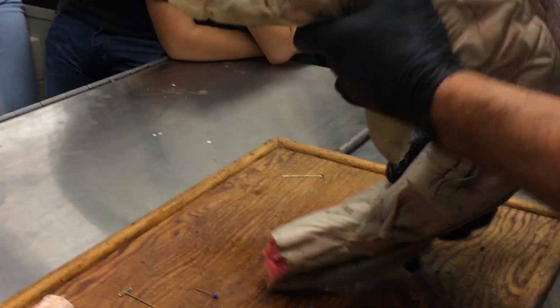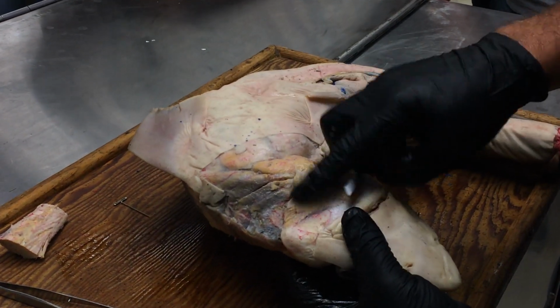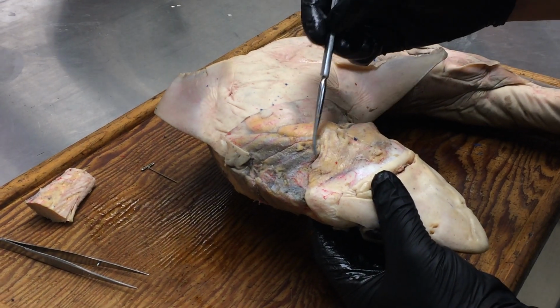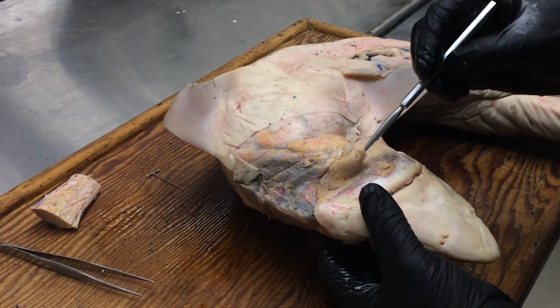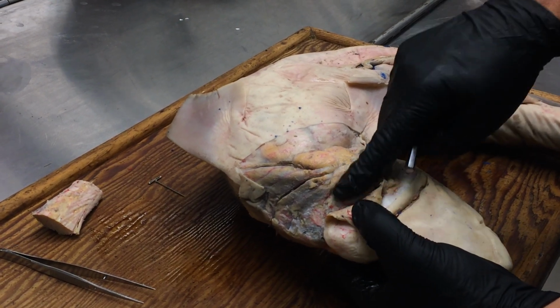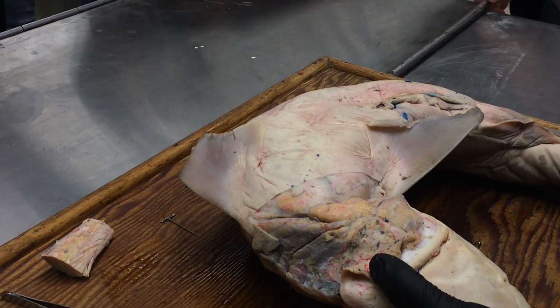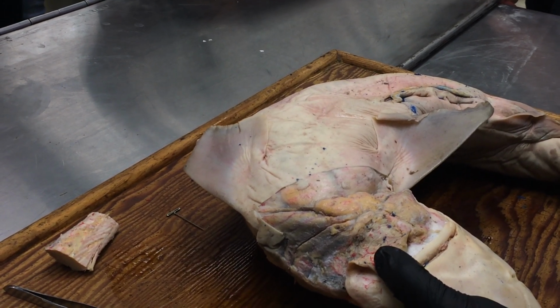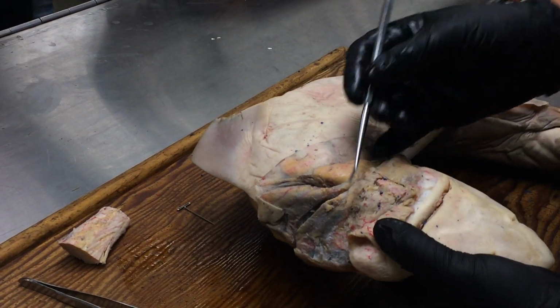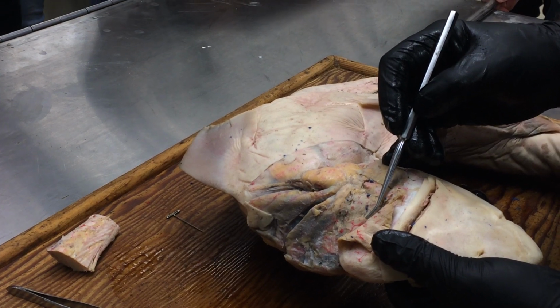For hyoid arch, if we go back ventrally, we can see there's an interhyoideus that lies deep to the intermandibularis. And so if we flip the intermandibularis back, and this I was able to do on this shark more easily than you could on yours because this is a really big shark and they're very thin muscles. So don't feel bad if this didn't come out quite so well on yours. But you can see there's this deeper layer in there, and that's the interhyoideus.